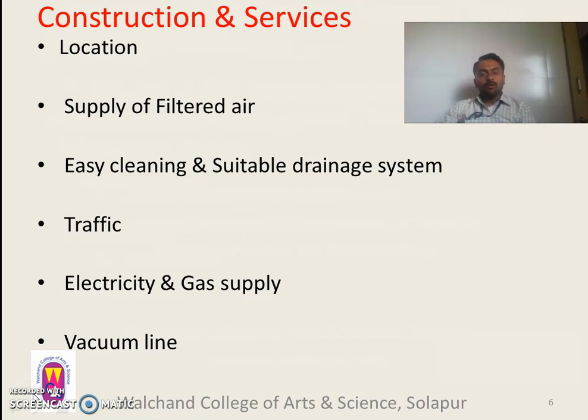Then the workers and the laminar air flow units which are maintained in the laboratory are placed away from each other. Approximately 2 feet distance is present between them, and head to head 8 feet distance is there, so that traffic should be avoided. Workers do not gather simultaneously in this sterile working area where laminar air flow units are placed, so that traffic is minimum.